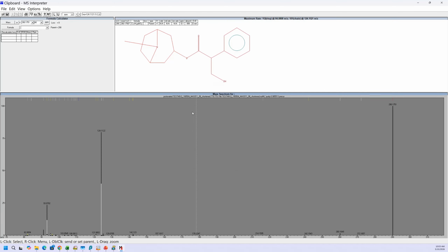So it's somewhat the same as when we sent it over from the chromatogram window. It's just another way. If you have anything that you want to pair together when it's in the lib search window, you need to do it in this manner.